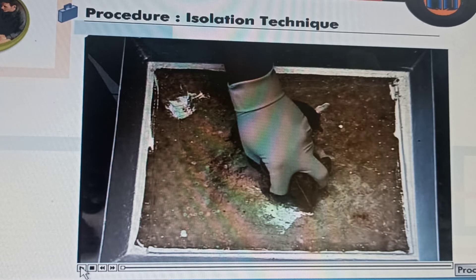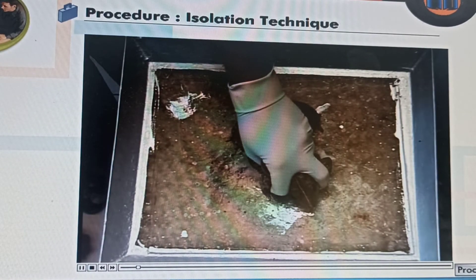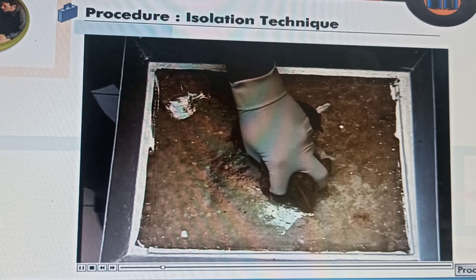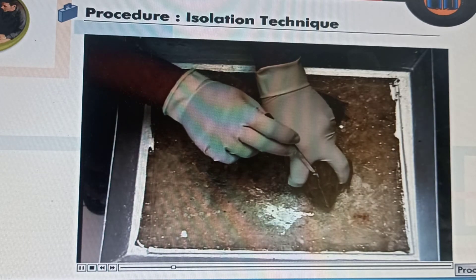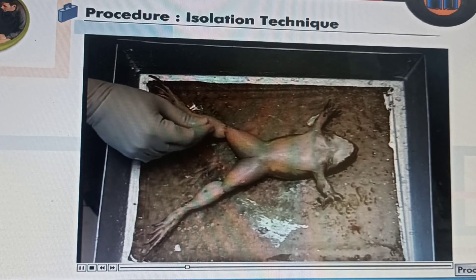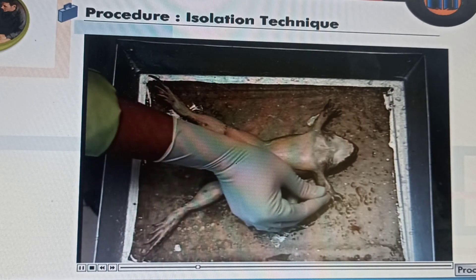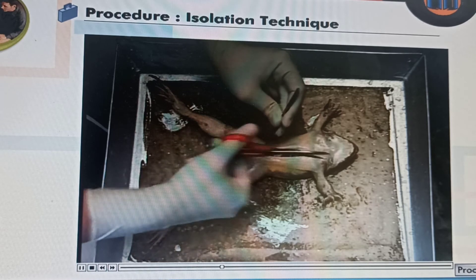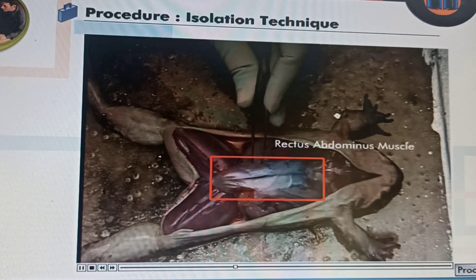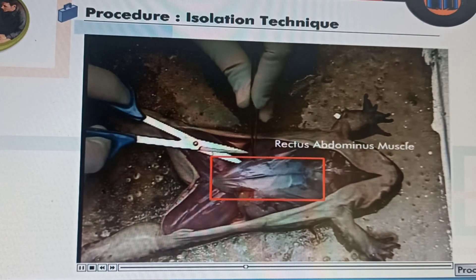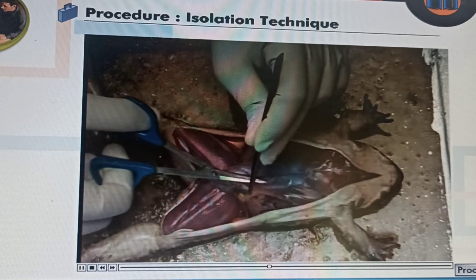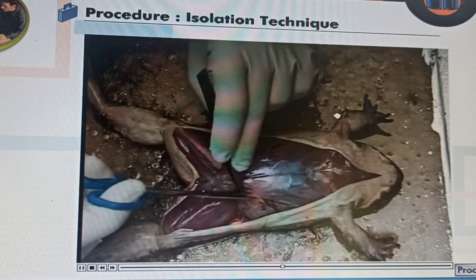Now let us look at the isolation technique of the muscle. To study the effect of acetylcholine on frog's rectus abdominis muscle, select a healthy frog. Pith the frog with the help of a pithing needle. Then pin the limbs of the frog to the dissecting tray. Remove the abdominal skin to expose the rectus abdominis muscle. To isolate the rectus abdominis muscle preparation, take a side cut on the rectus muscle. One can prepare two muscle preparations from a single frog.